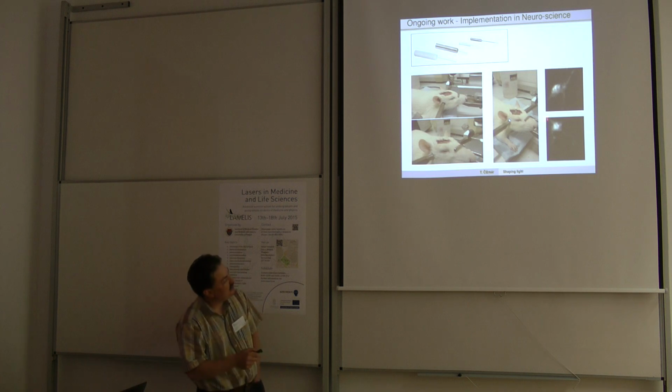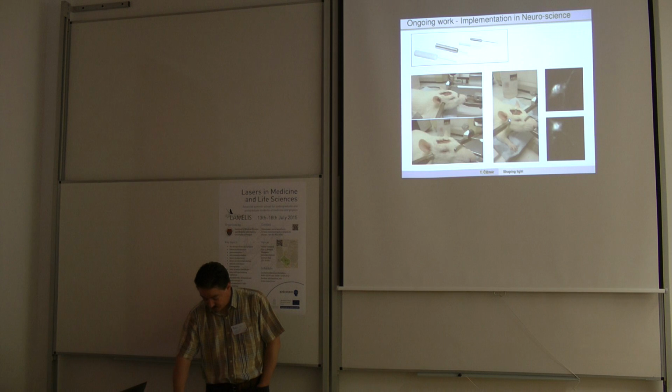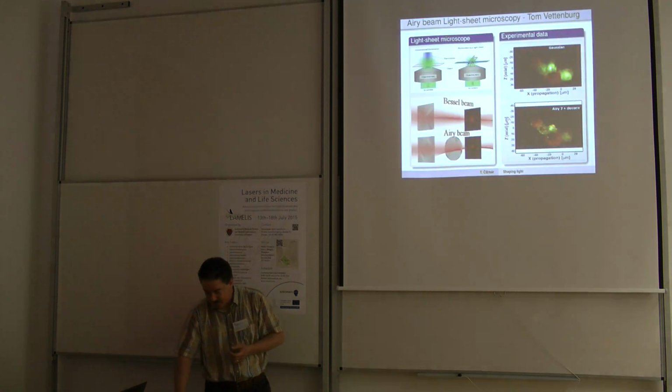And these were some first, these are still ex vivo, but these are still some first images of the neurons, and we hope this could be the dendritic spines. At that time we had very bad electronics on the detection, so hopefully I'll get some decent images very soon. But you can see we only need this much of a fiber in static geometry to do already sample research.